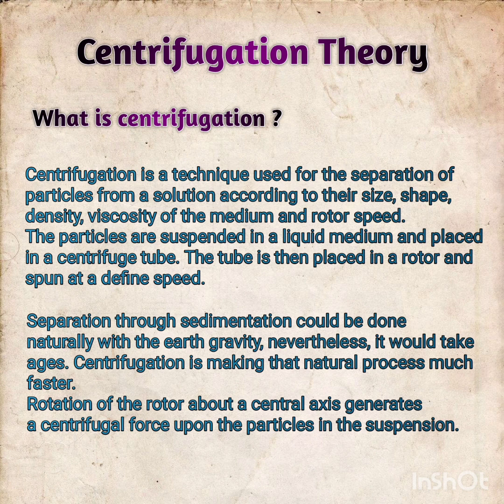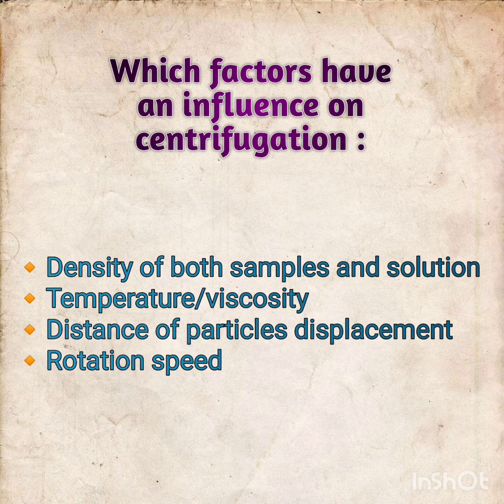So let's talk about the factors which have an influence on the centrifugation technique. Those factors are the density of both the sample and the solution, the temperature, the distance of the particles, and the rotation speed. All these factors have some influence on the centrifugation process.